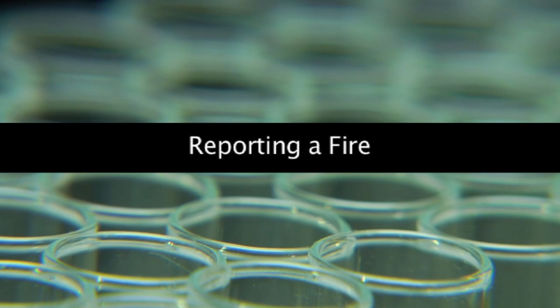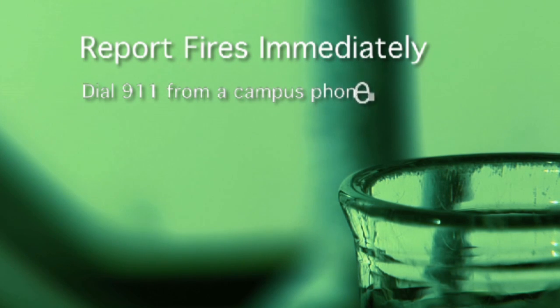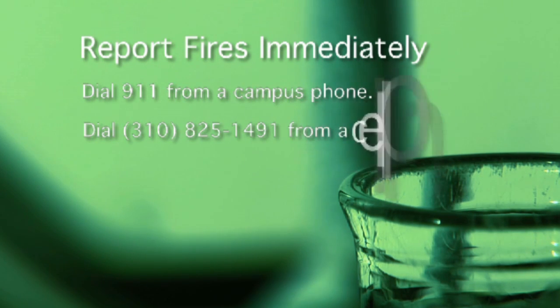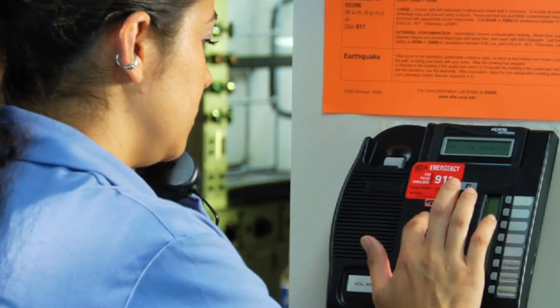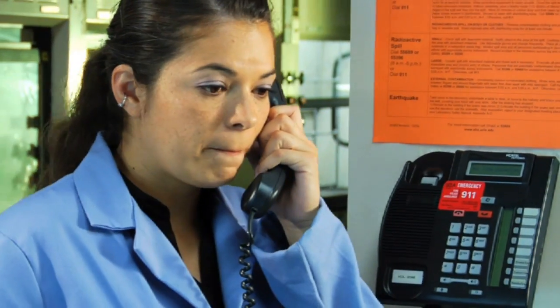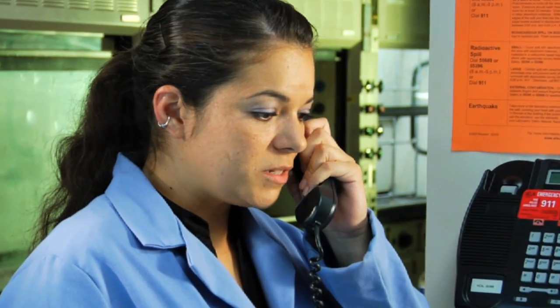When a fire is discovered, regardless of its size, report it immediately. From any campus phone, dial 911. From a cell phone, dial 310-825-1491. Be prepared to tell the operator vital information, such as what is on fire, where the fire is located, if there are any injuries, and if you are going to try to use a fire extinguisher.